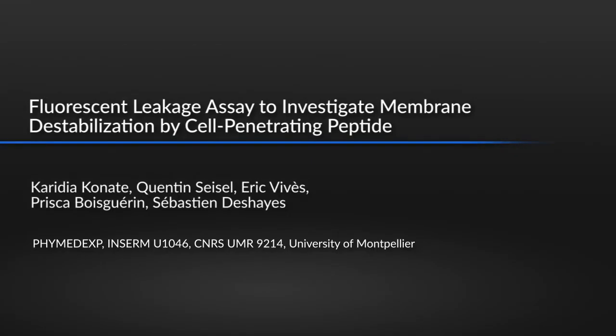This fluorescence leakage assay is a simple method for addressing membrane destabilization by biomolecules. Using liposomes encapsulating fluorescent dyes, it can be used to compare different membrane-interacting peptides. This method is especially useful to investigate membrane destabilization by cell-penetrating peptides in order to understand their mechanism of cellular internalization and to assess their involvement in direct membrane translocation.